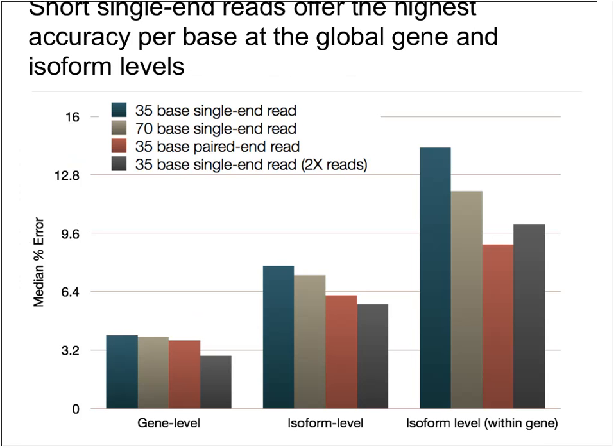Okay, another thing that we've done with RSEM is to look at how you design RNA-Seq experiments to get the most accurate quantifications. Here we considered the scenario in which you had a fixed budget for the number of bases that you were able to sequence, in a very simple economic model in which you pay per base.